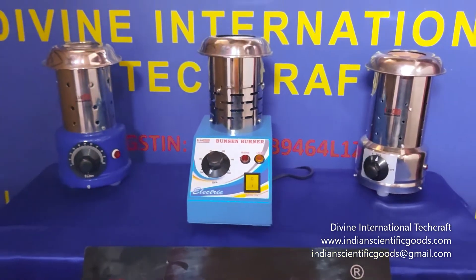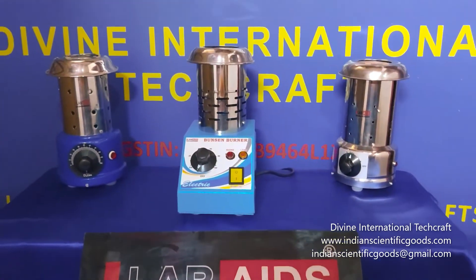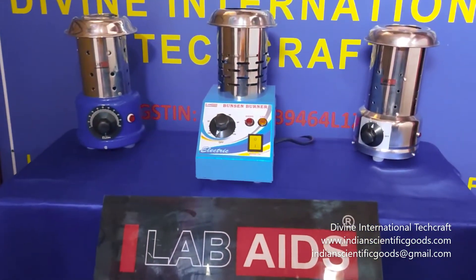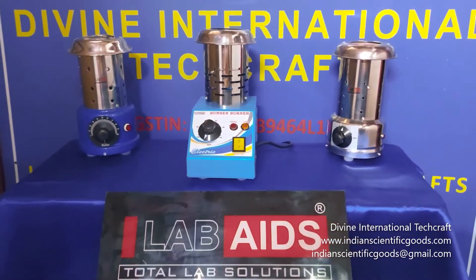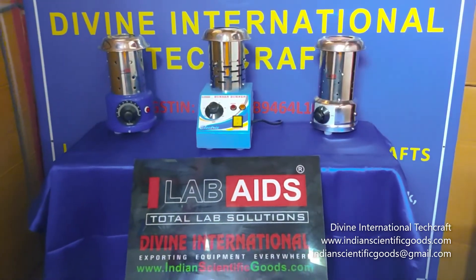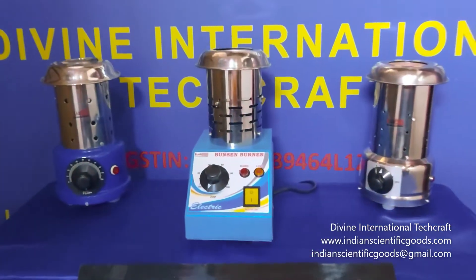All other functions and specifications of this Bunsen burner are the same as the round bodied Bunsen burners. The only difference is in the design and shape of the base body. We await your inquiries and orders for this product. Thank you.